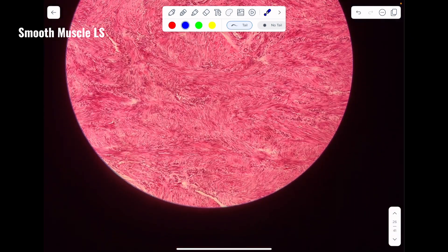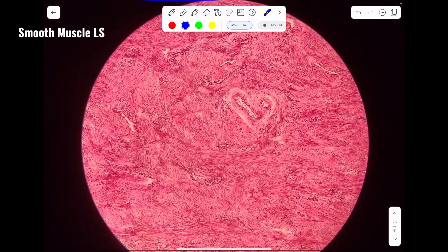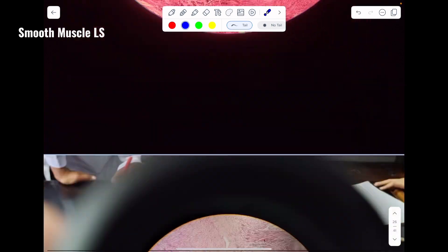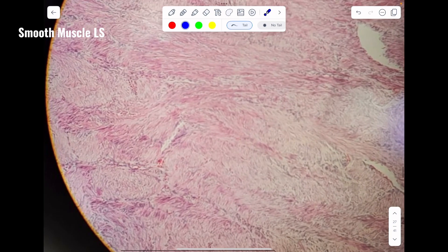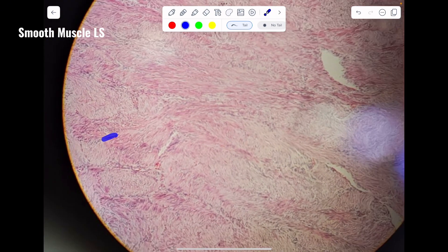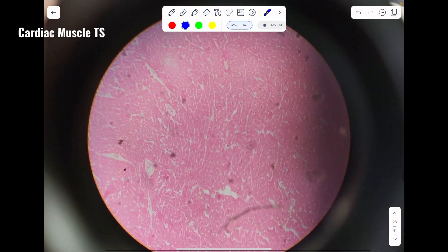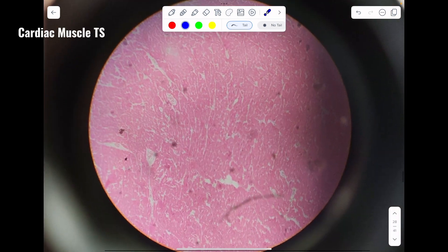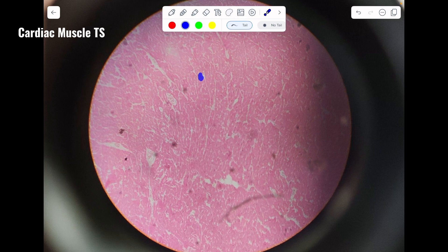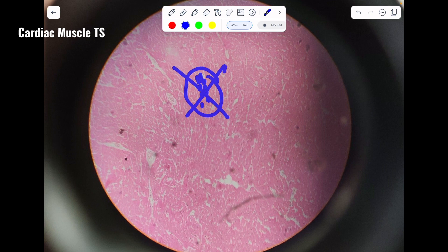Smooth muscle is very easy to demarcate or separate from the rest of the histological slides of the muscles. Again, spindle-shaped cells with elongated nucleus, overall appearing very messy. In this particular slide you can see muscle fibers; however, they are not arranged in bundles and there is no perimysium or gap between them — there are no bundles in the first place.